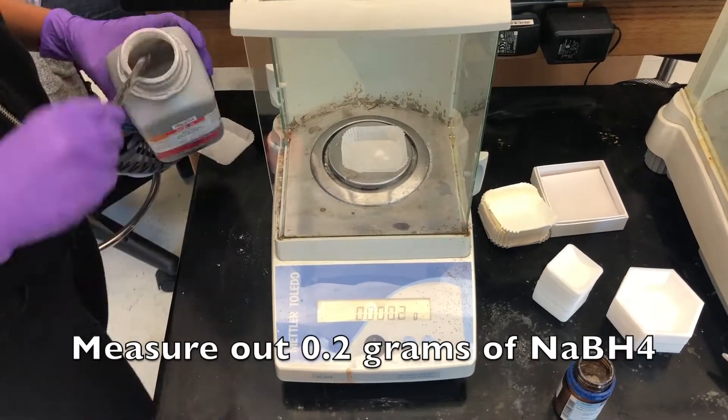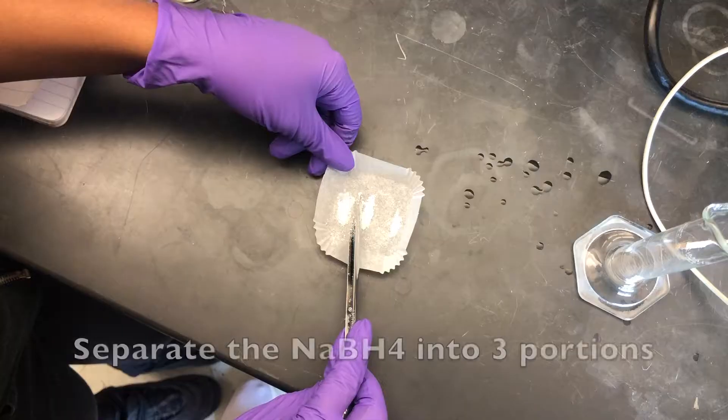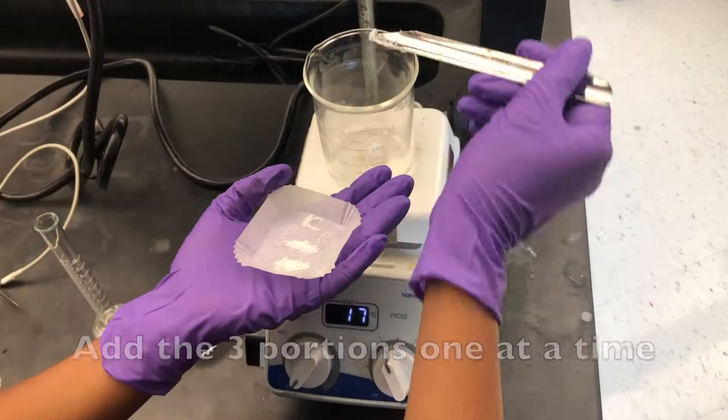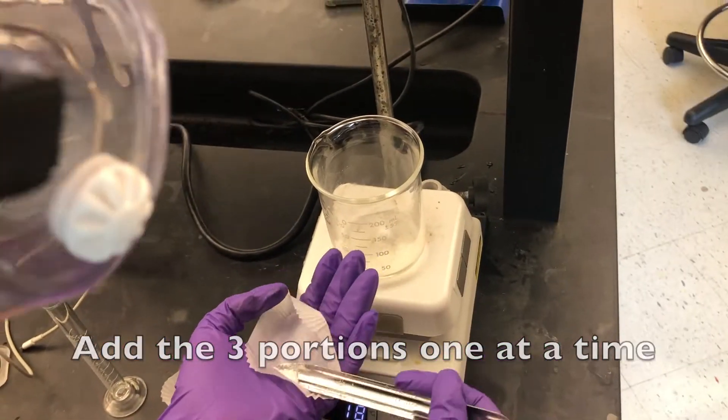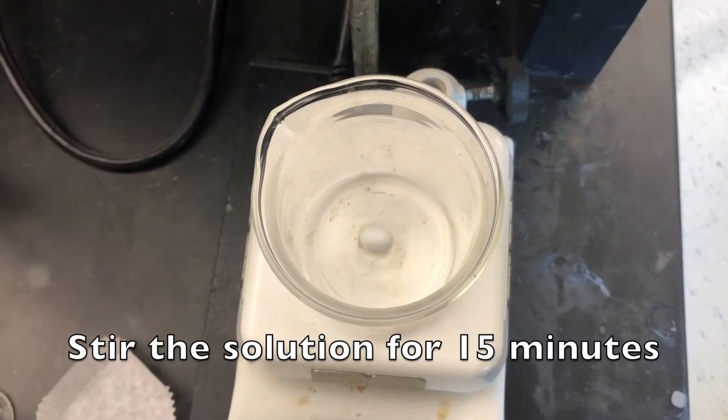Measure out 0.2 grams of sodium borohydride. Separate the sodium borohydride into 3 portions and add the portions one at a time. Stir the solution for 15 minutes.